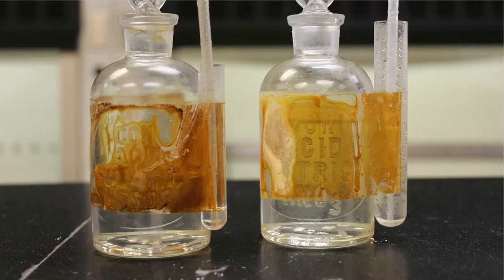So the one to the right-hand side, you're going to see conch right up here at the top, nitric acid, and the one to the left, you're going to see conch, sulfuric acid. These are concentrated. They do burn. They eat metals. I can dissolve a penny very easily with nitric. I can dissolve your clothing and your shoes very easily with sulfuric. And if they get on you for any long period of time, they are going to start to burn and they're going to start to eat your skin. So we got to be careful with them when we handle them.